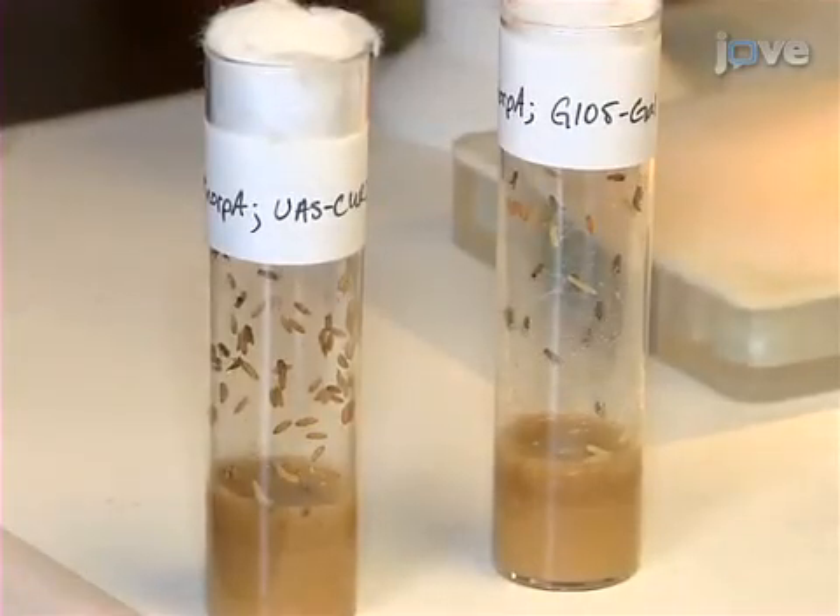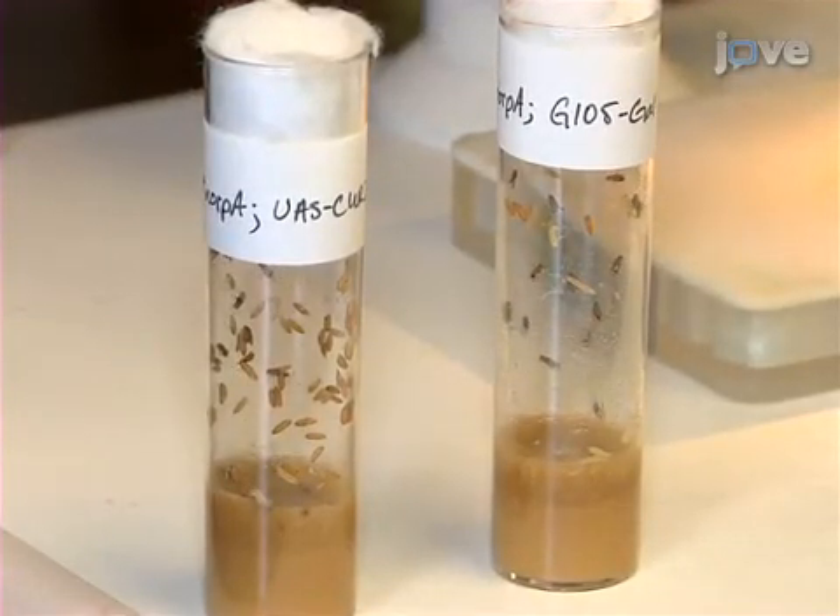First, cross the UAS channelrhodopsin-2 flies with the appropriate GAL4 driver.